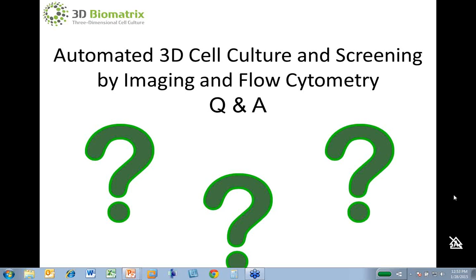Okay, so for the first part of that question, is polyvinyl alcohol toxic? No. If you check the literature, it's been used quite extensively in both cell biology and developmental biology for quite a long time to make hydrogels, essentially. So it's not really known to be toxic.